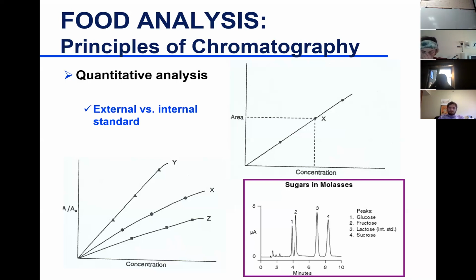Yes, Rachel, is there a question? Yeah, but doesn't the internal standard reduce errors? Exactly, that's what it means. Is your volume on? No, they can't hear you. But everybody can see the question. Using the internal standard accounts for human error. That's exactly why we are using an internal standard, to account for human error that can happen during sample preparation. So you account for that. Can I answer your question? Oh, that's okay. All right.